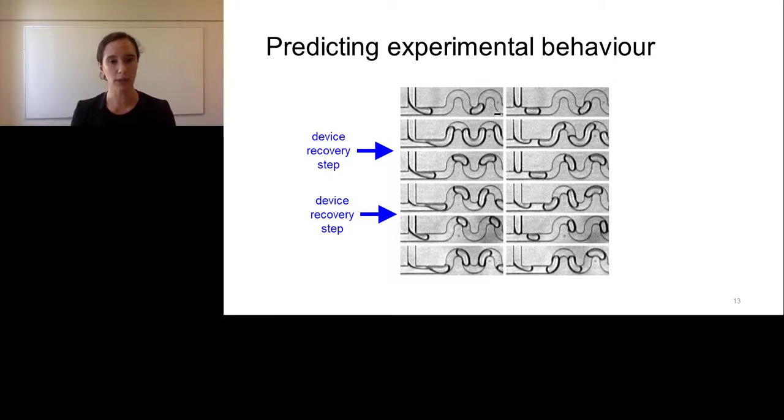If you look at this slide, you have the sequential images from top to bottom, okay, of different steps in the experiment. Left to right is the image just before the droplet forms and just after the droplet forms. At the top you have the device, it's new, it's running, and you can see that the droplet forms really cleanly at that T-junction. Then over time, as we add more water, more droplets into our system, you can see that that dripping failure mode starts to happen. You can specifically see that on the image on the right-hand side, because you can see it sticking.